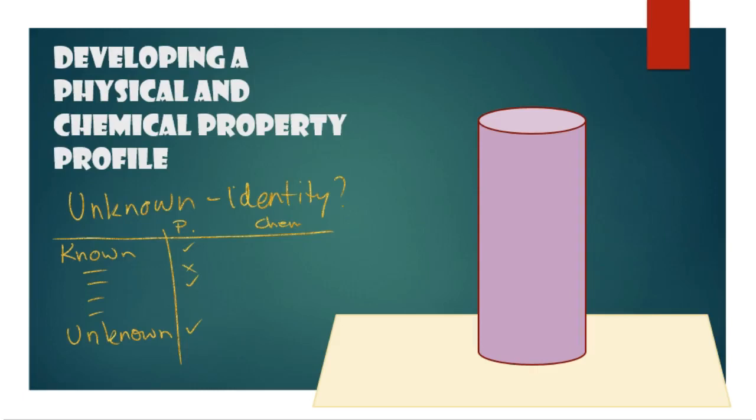First of all, you just have to look at it without doing anything to it. You must just look at it. Okay? So we get a small amount of that white substance. I think I've said in there only about 1/4 of a spatula. And put it in your test tube and have a look at it and record down the different physical and chemical characteristics that I've asked you to. That's number one. Number two, we're going to look and see what happens when we mix it with certain substances. It may dissolve, it may not dissolve, it may chemically react. You have to find out.